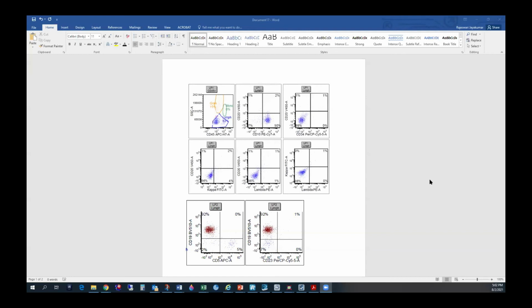So this is a patient who had a history of follicular lymphoma, and this was a follow-up bone marrow they did for staging. Did he receive rituximab then? Yeah, CD20 negative. Okay. That's it? No, there is another twist to it. CD10 positive, and then it's kappa negative. There's another twist to it.